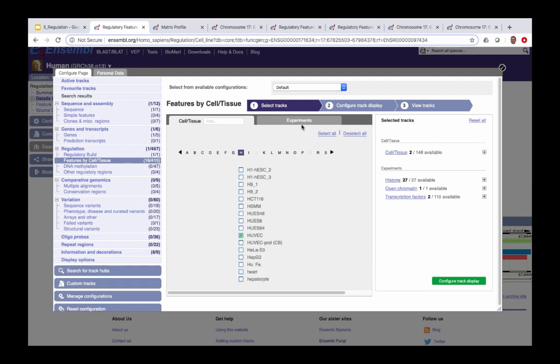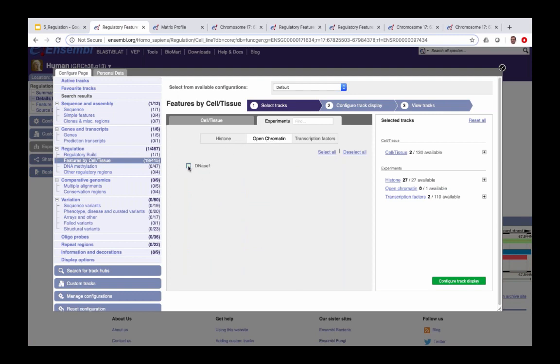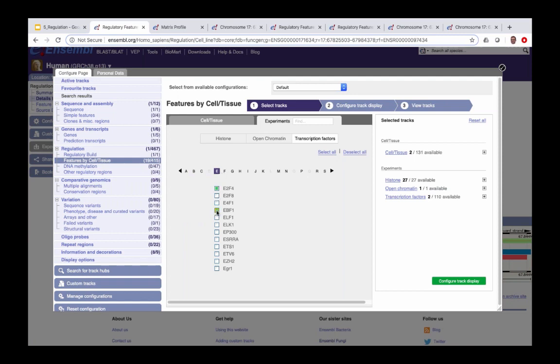Once cell types are selected, we move to the experiments tab. There are three different categories: histone modifications — where you can select specific modifications or use Select All/Deselect All — open chromatin, and transcription factors, where you can browse alphabetically and again select all or specific factors of interest.